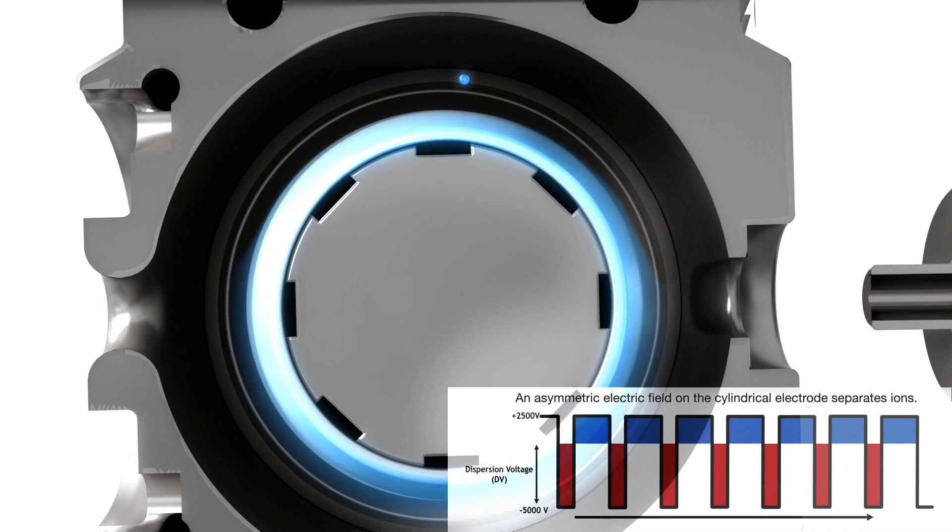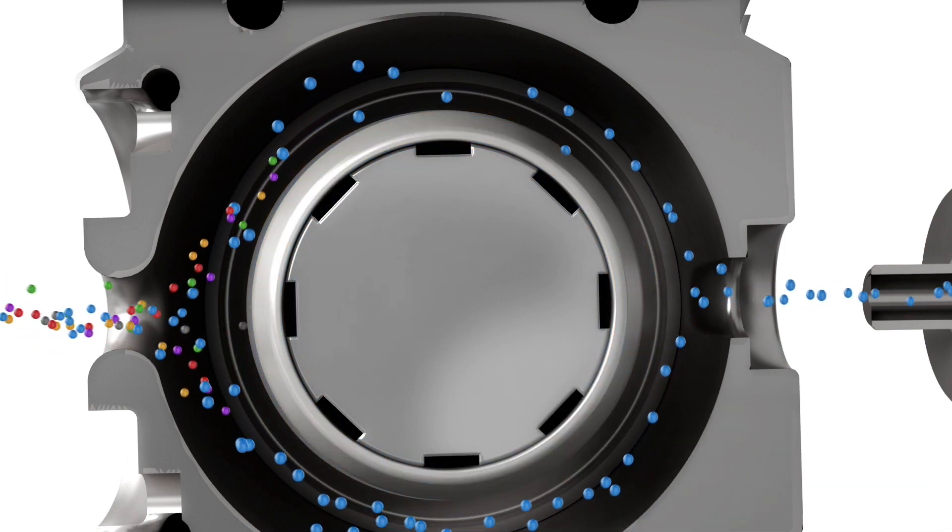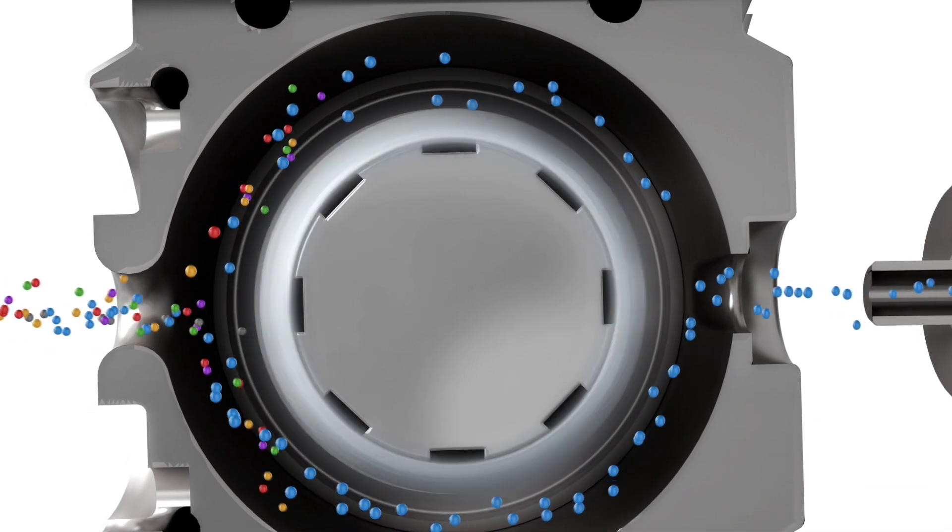Dispersion off the x-axis is due to ion mobility differences at the high and low field strengths and durations. During the ion's residence time, voltage switching repeats for tens of thousands of cycles. Each cycle causes greater dispersion.